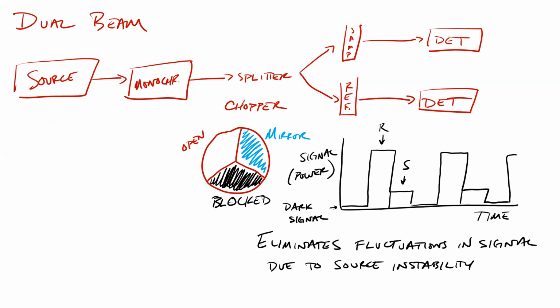And then a detector diode has electricity that flows through it constantly, but when light is shown on the material that electricity flows through, the current changes based on how much light is being shown on the material. They're like the traffic cops of the electronics world. They don't have to have anything to do with light, but they have developed these particular types that can either give off or absorb light. Okay, thank you.